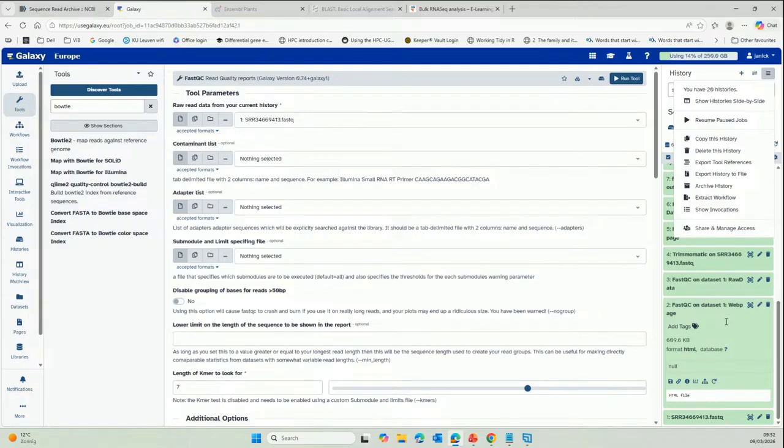You might think, why doesn't she share a workflow with us? Well, because the parameter settings of the tools are very specific for the data that you have. Your own data will probably always be the same. I mean, if you use a stranded protocol now, you're also going to do it the next time that you generate bulk data, unless you weren't happy with the results. The setup of your experiment will be the same every time you do an experiment.